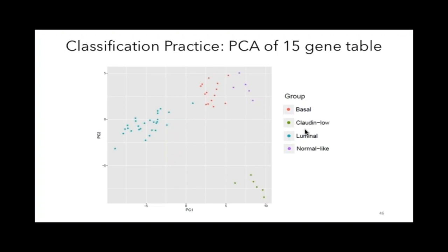And then let's look at how feature selection can affect unsupervised analysis. So now, when we have 15 informative genes, we can rerun our PCA with only these 15 genes. And here we see that the plot really looks better. So we removed all noise, and the PCA plot looks really pretty.